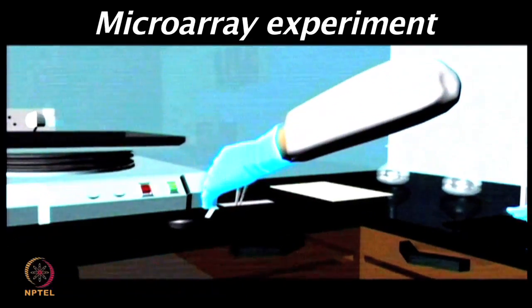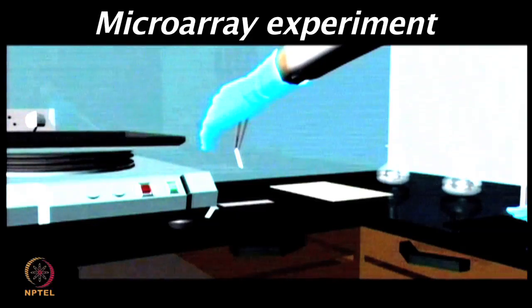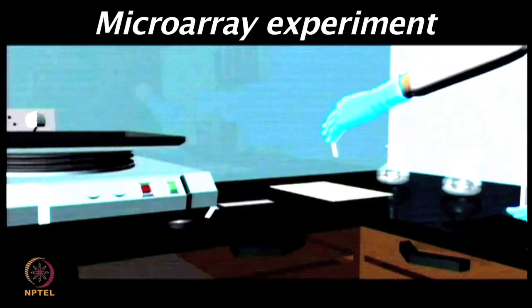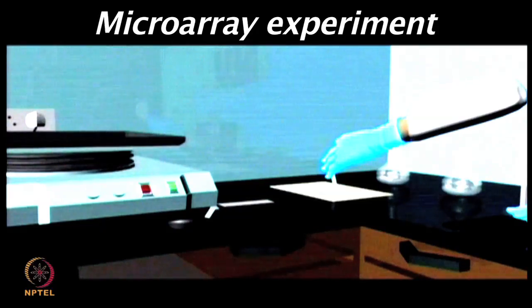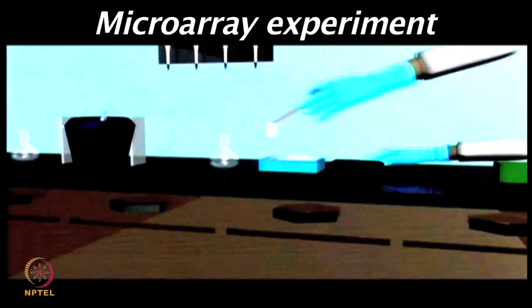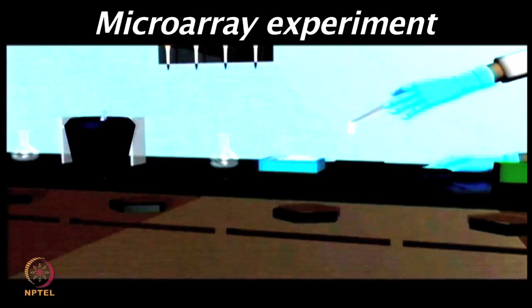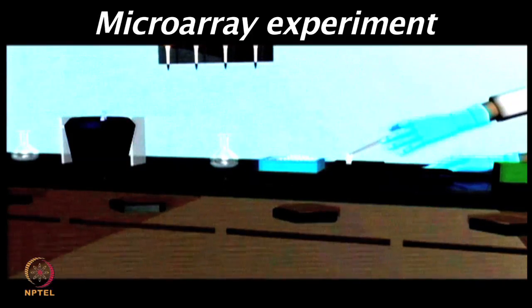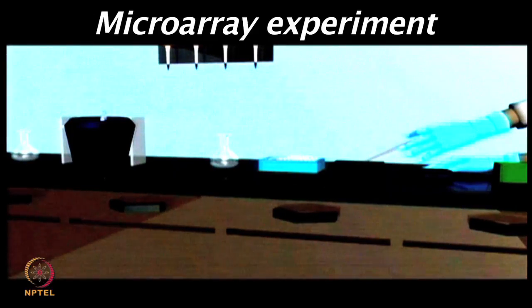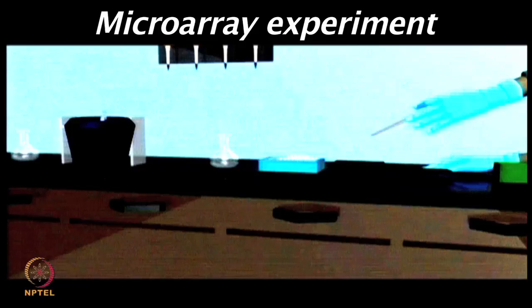One needs to do at least 3 or more washes with PBS and PBS tween, just so that you are removing all the bound antibodies on the non-specific array surface. If your washing steps are not very meticulous in the microarray experiment, at the end you will see very high background and you will see many non-specific bindings, which will interfere with the signal detection.